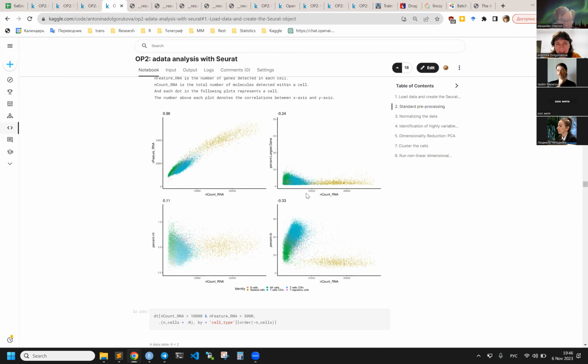Well, you can recall how the data were processed in this competition: we have only a few samples, few observations from myeloid and B cells, because it's training data. So we have only 15 drugs for B and myeloid cells. So all those dots may come from controls, right?